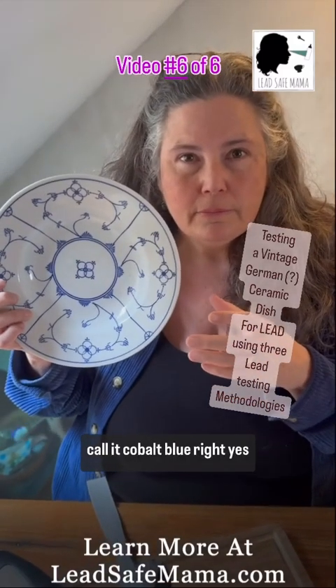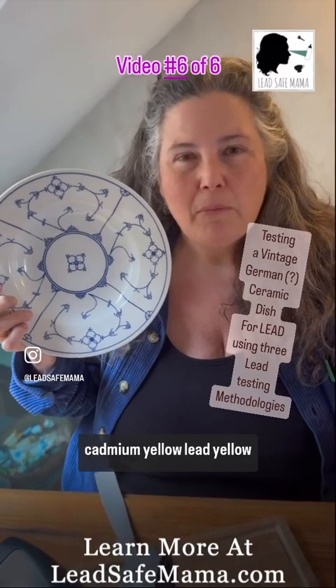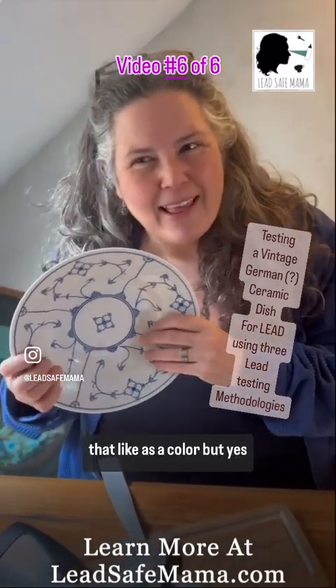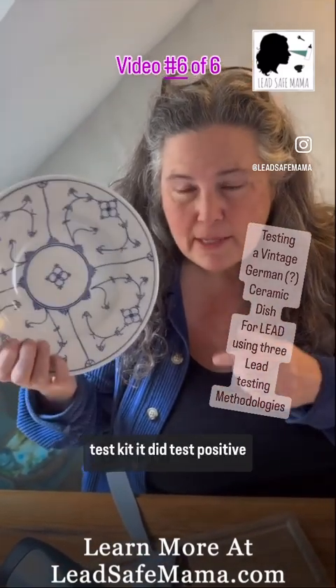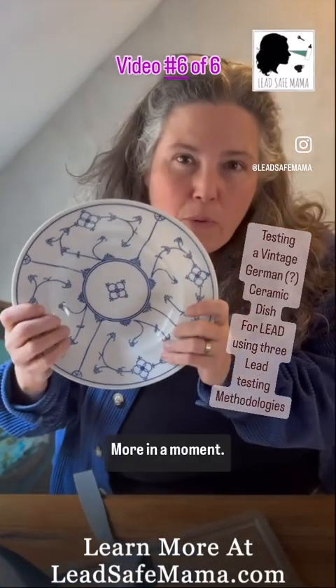They even call it cobalt blue, right? Yes they do — cobalt blue, cadmium red, cadmium yellow, lead yellow, lead red, arsenic green. I haven't heard that as a color name, but yes. Alright, so we're going to follow up by testing this with the reactive agent home test kit. It did test positive for trace levels of lead. We're going to see how that turns out — more in a moment.